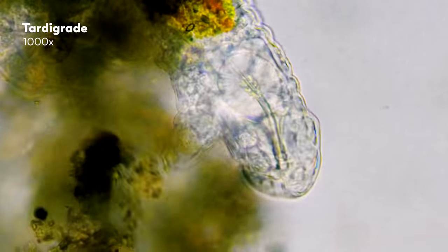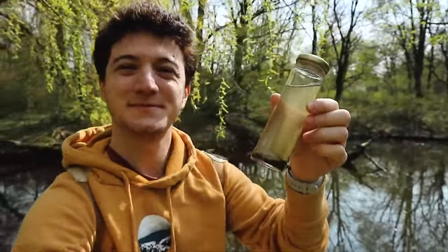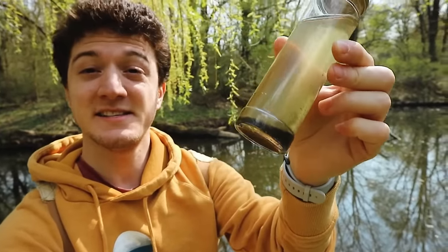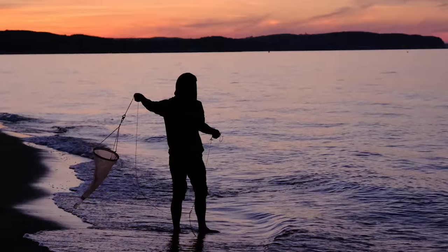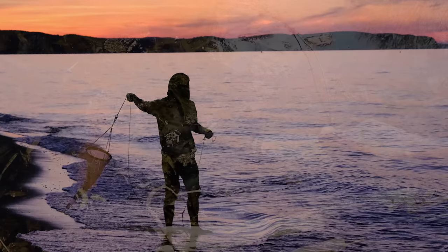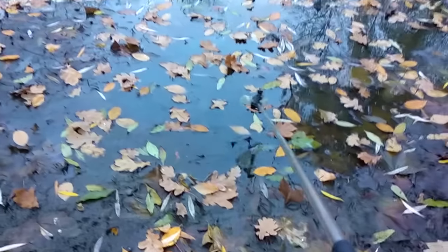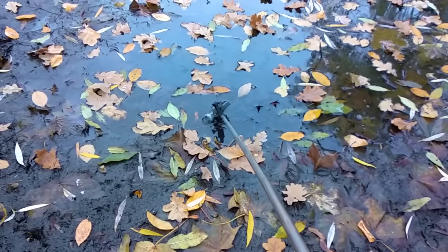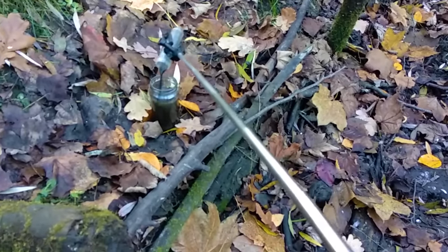Many of you have asked how we find and care for our microscopic friends. James, our collector of microbes and master of microscopes, takes samples literally from everywhere he can, but his favorite spot is a park just next to his house. Collecting these samples requires some high-tech equipment, like a selfie stick, which James bought and converted into a portable sampling stick that lets him reach tough spots. It's lightweight, it's collapsible — what else do you need?